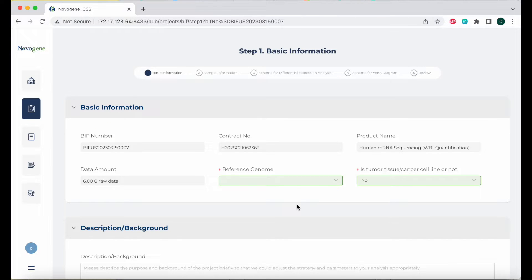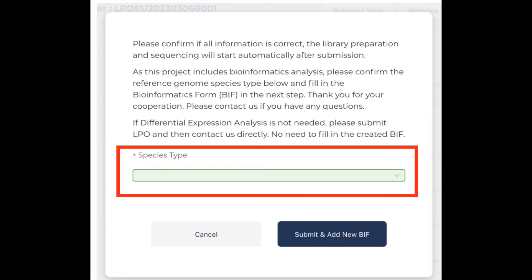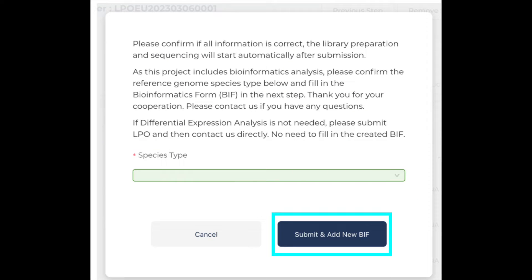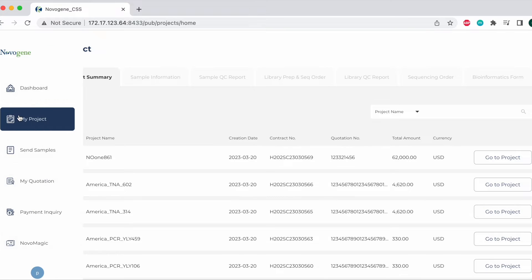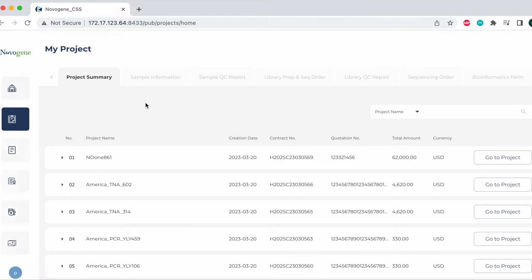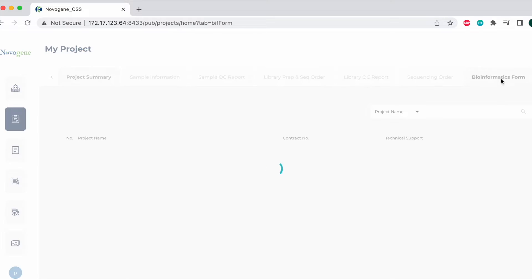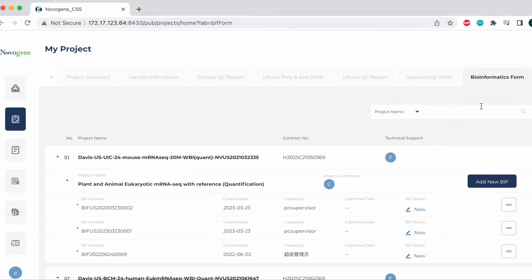If you do not want to create a BIF immediately, you can choose the species type, select submit and add new BIF, and then close the bioinformatics form page. You can create a new bioinformatics form at any time by going to the my project section on your dashboard, going to the bioinformatics form section on the tabs, and clicking add new BIF for the relative project.